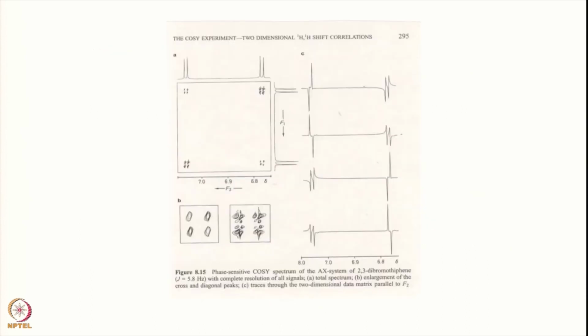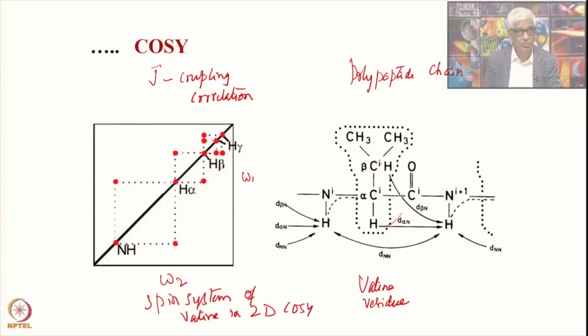Okay, let us look into this in more detail, a finer structure. I showed you that each one of them is a cross peak. Let us consider this cross peak here. I said this is one full dot which is actually indicated. Is it just a dot like this, or does it have any structure?